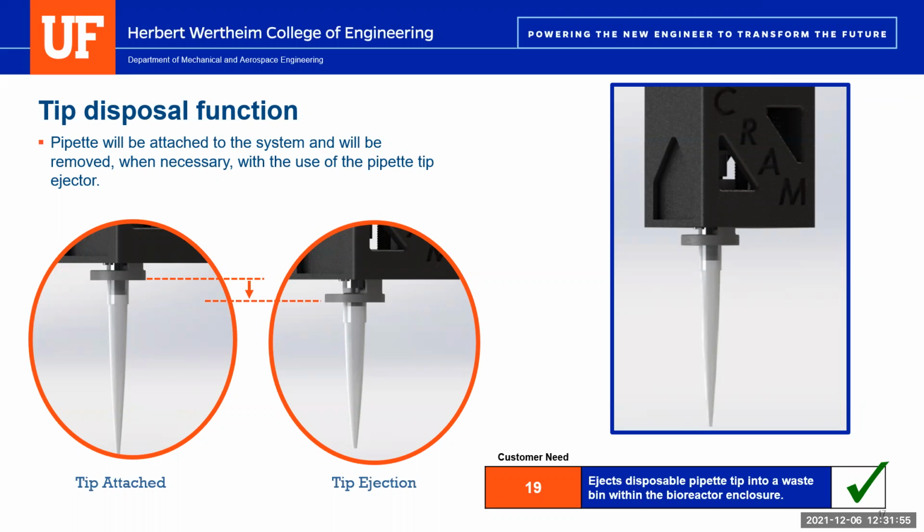Yes. What would your alignment tolerance have to be for that system in order to successfully engage a pipette? 1.5 millimeters, if I had it. Is that feasible? Is that something that you guys have talked about at the interface of the systems?